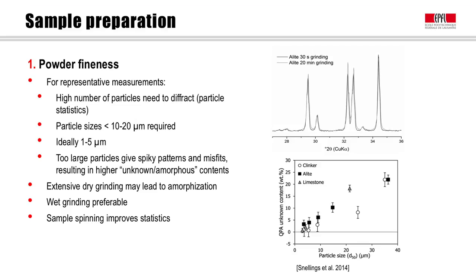However, one should be careful in grinding because extensive dry grinding may lead to amorphization of sensitive soft phases. Therefore, for any phases that cannot be affected, wet grinding is preferable. This can be done on any kind of clinker, alites, limestone and hydrous phases, for instance by using grinding media like isopropanol, acetone or ethanol.